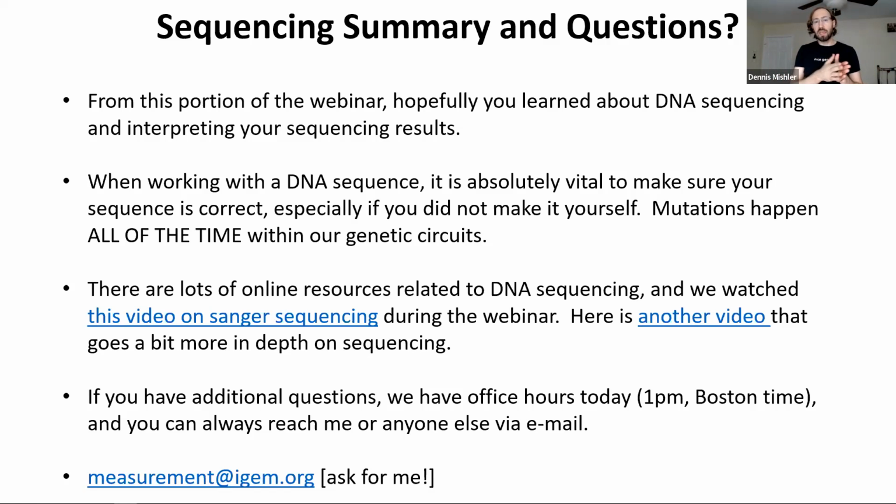If you see things are missing, so in the example there I had a potential deletion, right, and A was missing, that would be another example. Those are kind of the 2 main ways to do it. There are some other ways, like if you just see that you don't get the right sequence, right? If it should be green and it's not green, there's something wrong. But in terms of the sequencing results, that's generally what we're looking at.